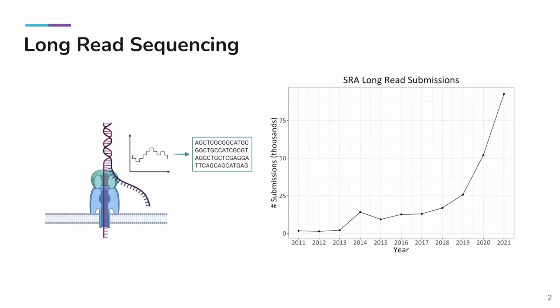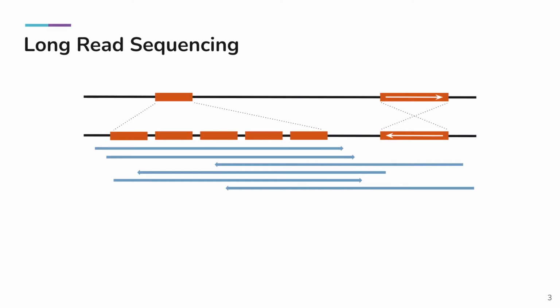Long-read sequencing technologies, such as from Oxford Nanopore and Pacific Biosciences, have been increasingly used in genomic research over the past several years, as these platforms have dramatically developed and improved. Long reads can span several thousands to even millions of nucleotides in length, and this provides valuable long-range genomic information for genome assembly. This information aids in resolving repetitive regions, identifying structural variants, and reaching chromosome-level contiguity.